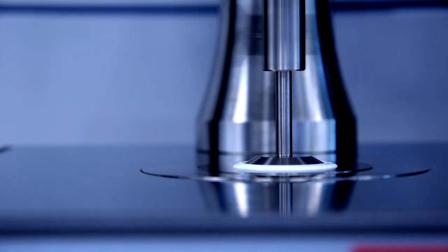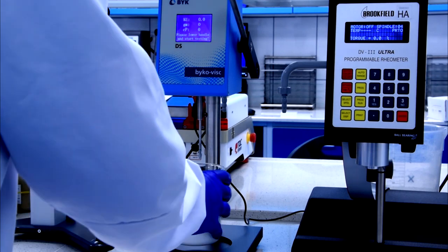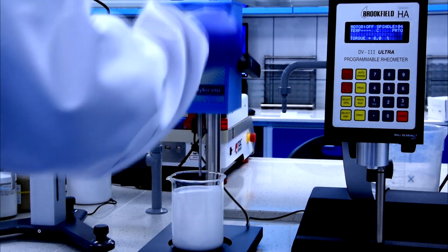The results are presented in graphs. As supplementary tests we perform spatter resistance in accordance with ASTM procedure, as well as synergy with other thickeners such as mid shear and low shear rheology modifiers.